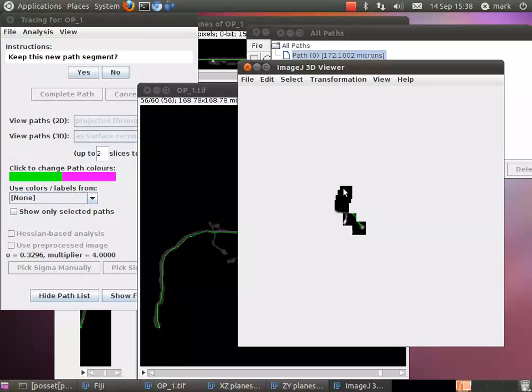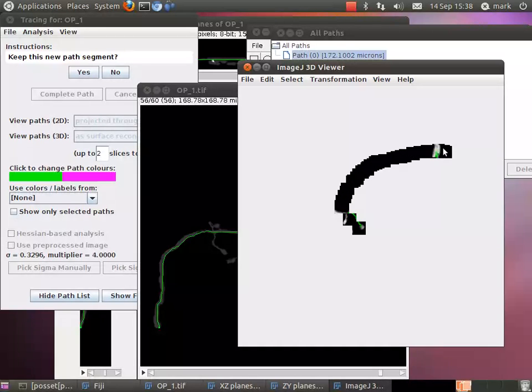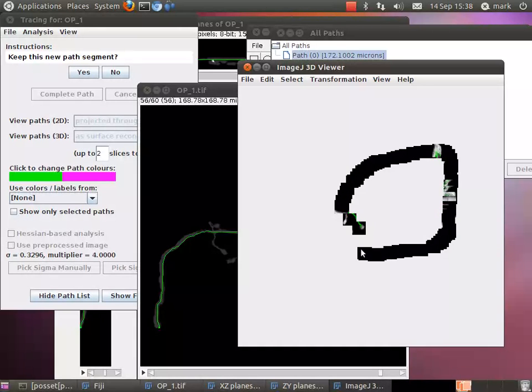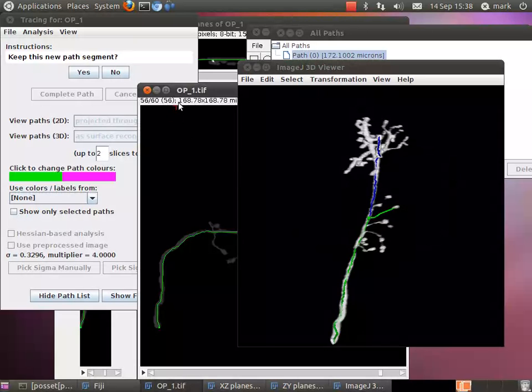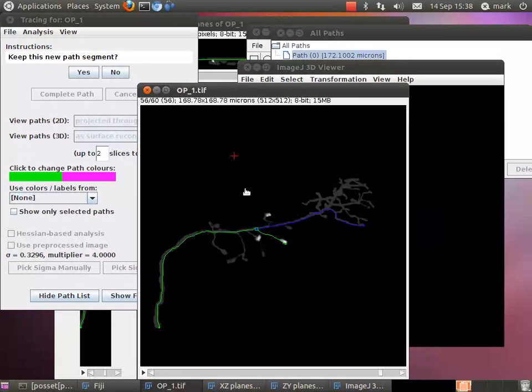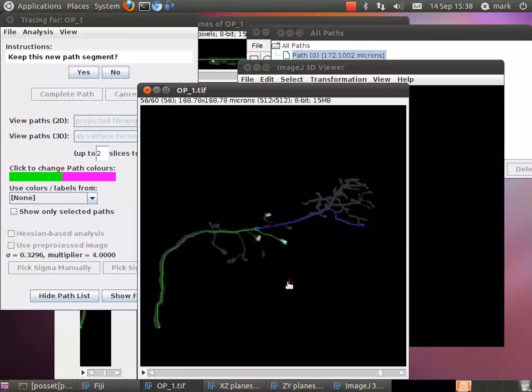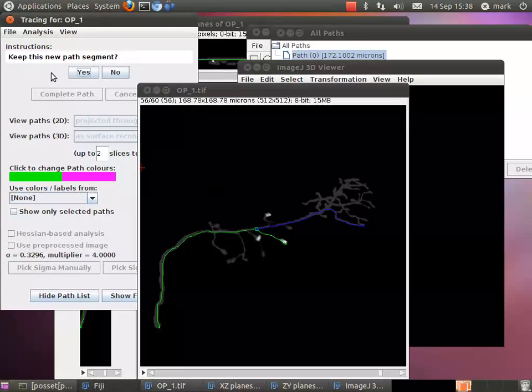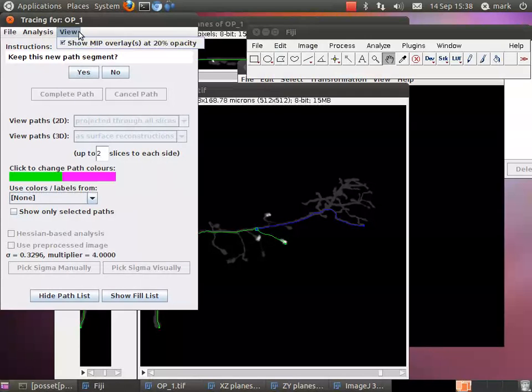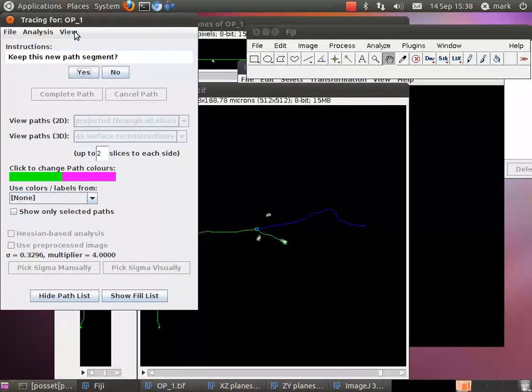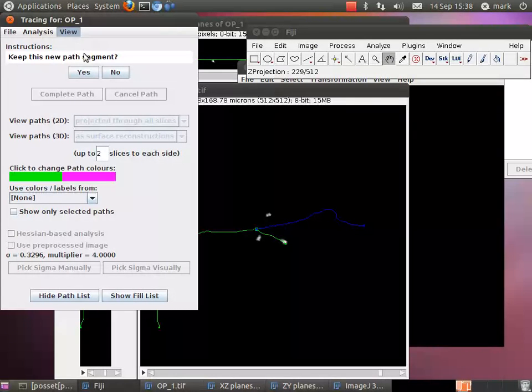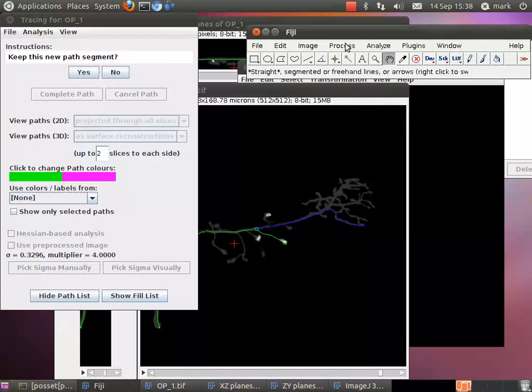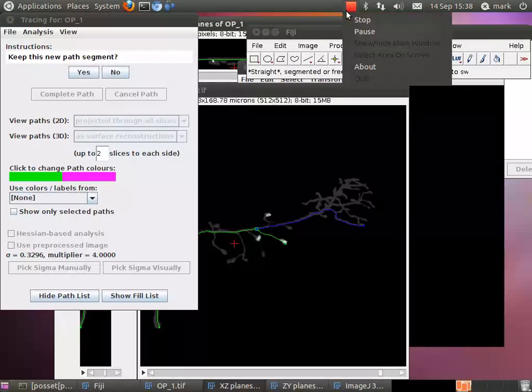So for certain types of neurons you might want to trace, this may speed up your tracing a great deal if you find yourself searching up and down the stack, and your structure is bright enough in the image or can be enhanced contrast-wise to make it bright enough that you can see them in this opacity overlay. And that overlay can be toggled on and off at any time if you're finding it confusing. Thank you very much.